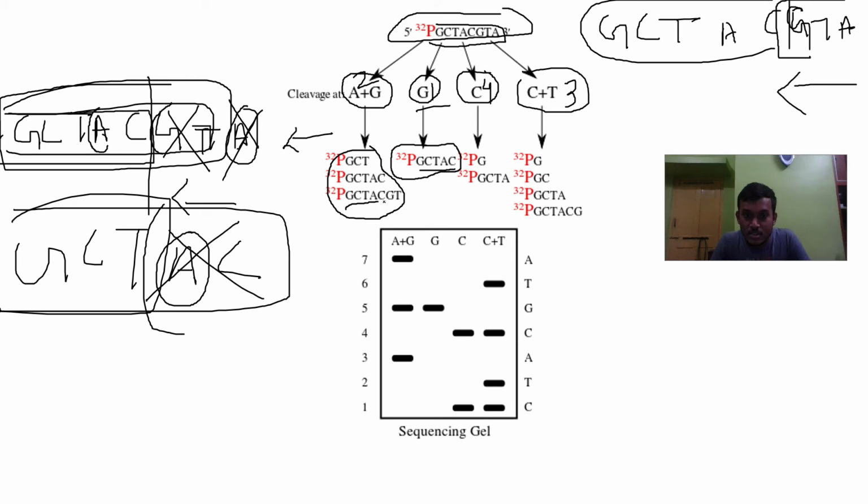So you can see the first sequence it takes after removing the A base. So it goes under scanning again. Then it finds a G base and removes the G base to find another sequence. And this particular sequence goes on scanning again. It finds a base. So it removes the A base and we get this final sequence. So we'll take all the 3 sequences, right?